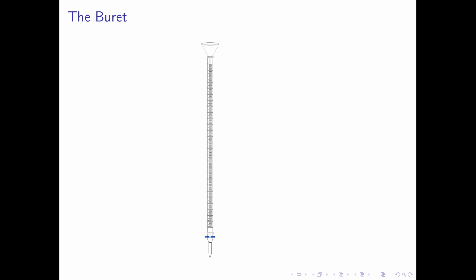To fill the burette, you first add a burette funnel and then you pour in the liquid. We make sure not to attempt to fill the burette all the way to the zero marking. There are two reasons for this. One, it's oftentimes very hard to accurately read the burette when it's filled to the top due to parallax. Secondly, trying to get the liquid exactly at the 0.00 marking is a waste of time when we have other experiments to perform. In general, we will fill the burette approximately 3/4 of the way full with whatever liquid we're working with.